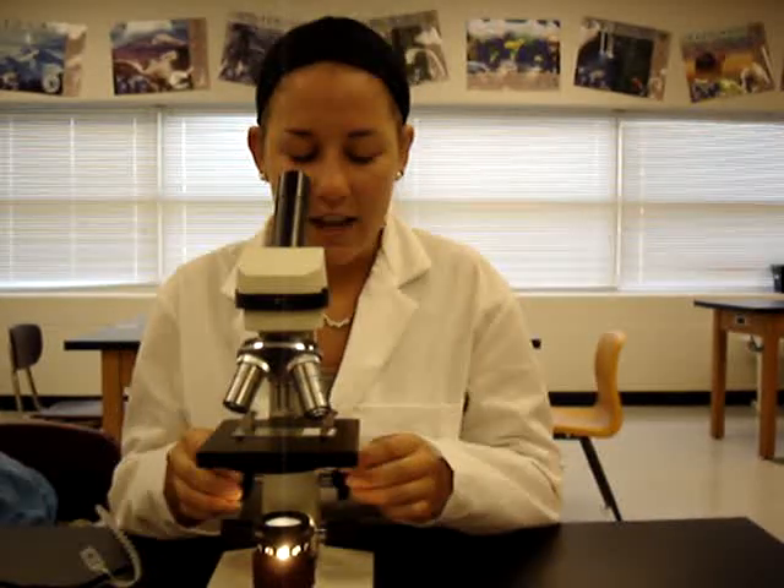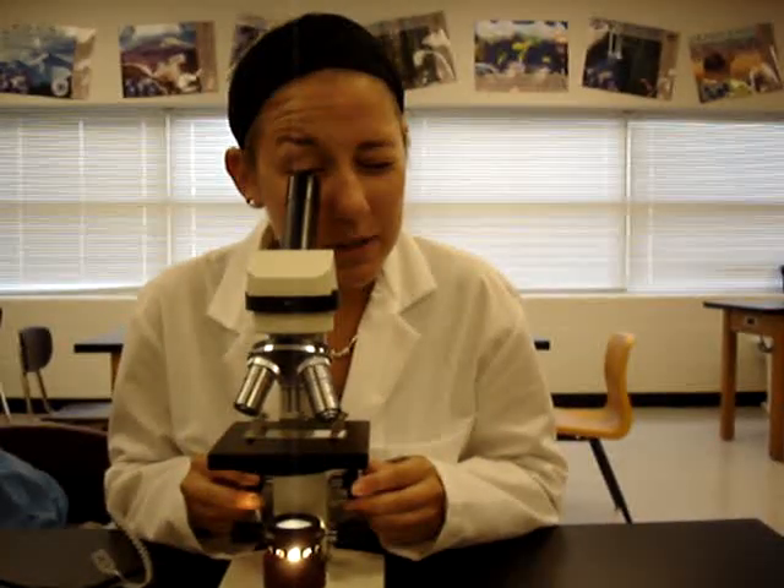Next, you can turn the microscope on. Look into the lens and use these bigger knobs called the coarse focus knobs to focus your image.